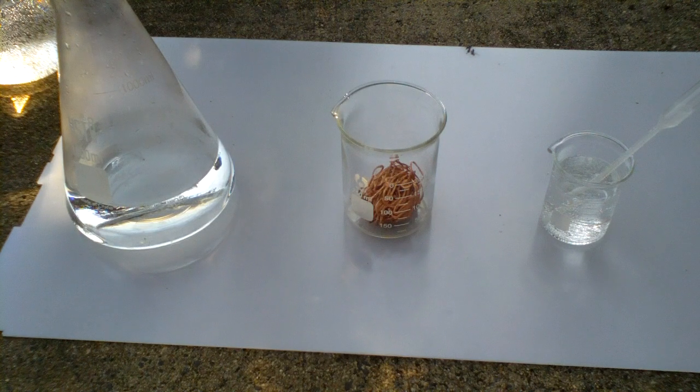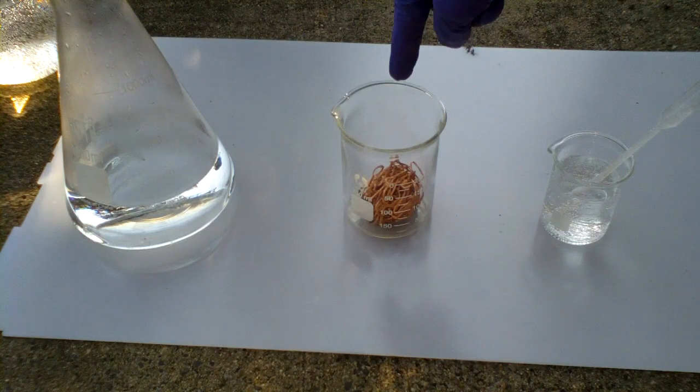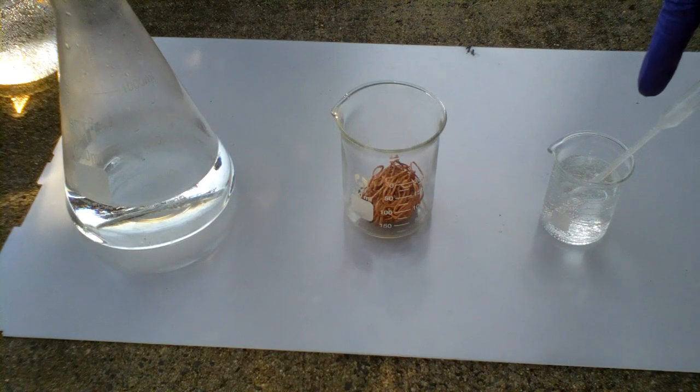In this video, I will show how to make copper(II) chloride, a useful copper salt in PCB etching. In order to make this chemical, you will need hydrochloric acid, this is 15%, you will need copper metal, this is stripped copper wire, and you will need hydrogen peroxide. This is 15% that I diluted down from Pool Shock.